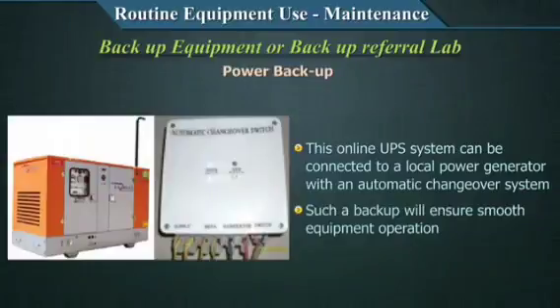This also may be a requirement in case of some of the labs, especially in remote areas with a lot of power outages. Please understand more on this through your electrical support unit in your laboratory, in your hospital, and this is something that you may want to discuss with your administration also.